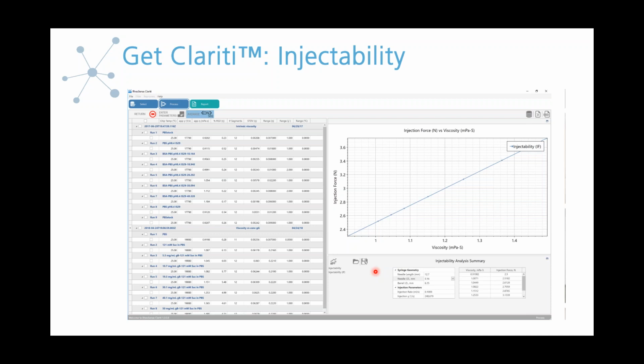That's basically a next generation implementation because there are some common shear thinning behaviors, which we'll talk about in a minute. But at this time, it's hard to predict non-Newtonian behavior, which is much more broad and a little more complex for the analysis. So that'll come about at a later time. But if you're dealing with Newtonian samples, or if you want to get an estimate for that, then our software can speed that up for you quite a bit.